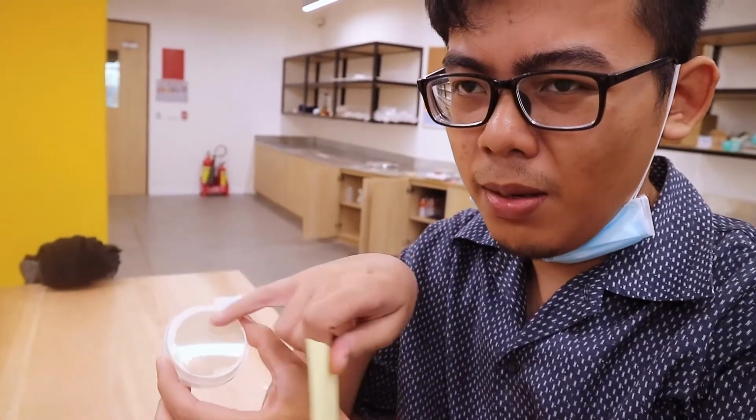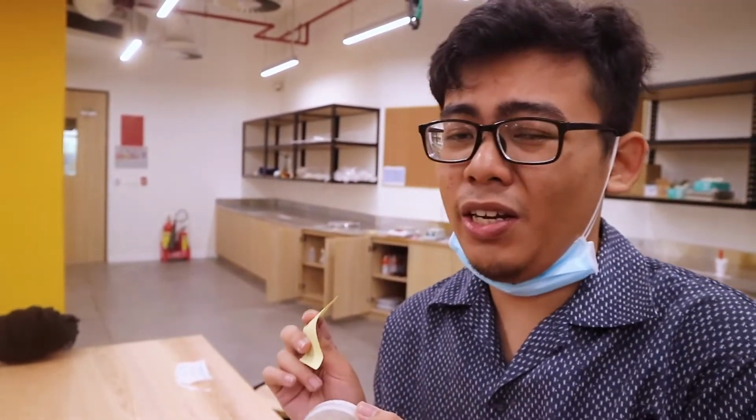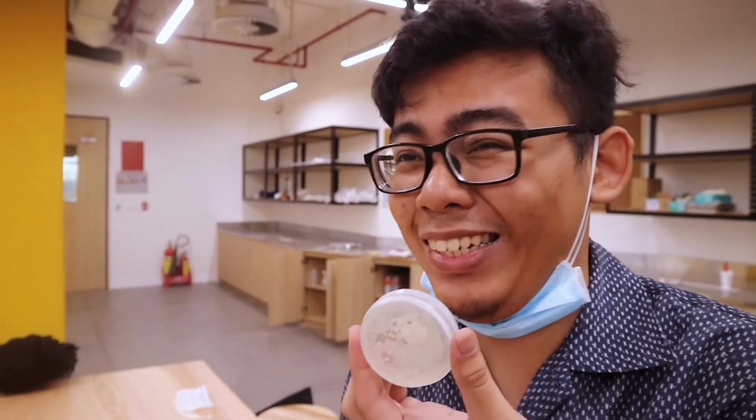Okay, so we had a brief argument about the strains of these bacteria. We are not experts in this field, so perhaps these white blobs are not E. coli, but the white spots are E. coli. I don't know. We need to check the morphology of these bacteria colonies in order to be sure what kinds of bacteria are found, but yeah, we know one thing for sure. If it's white, maybe it's E. coli.